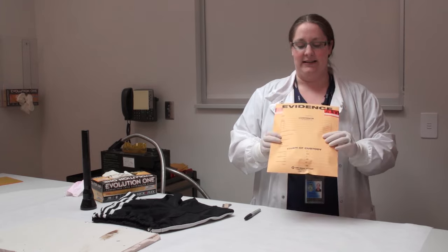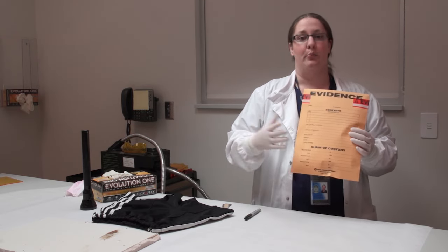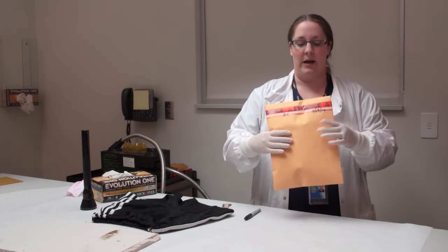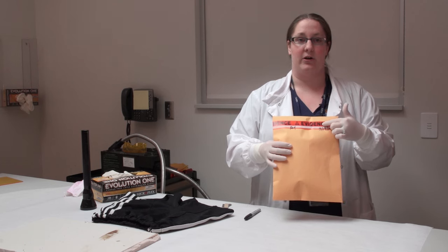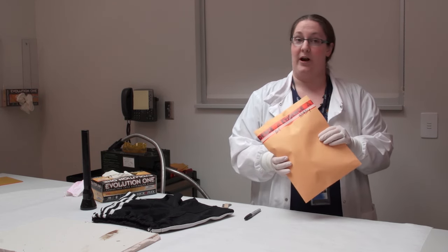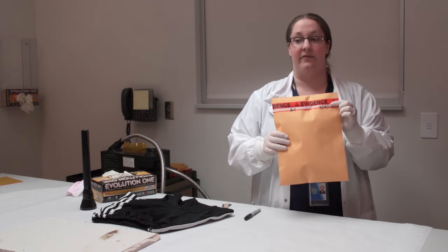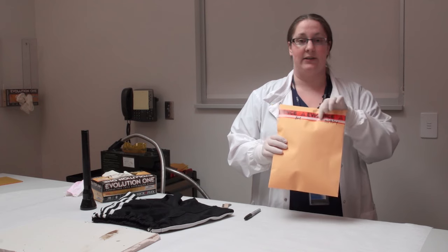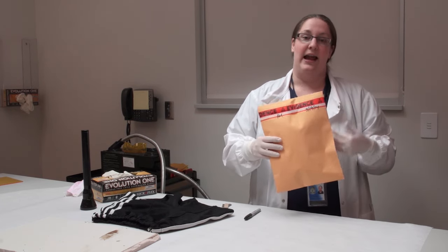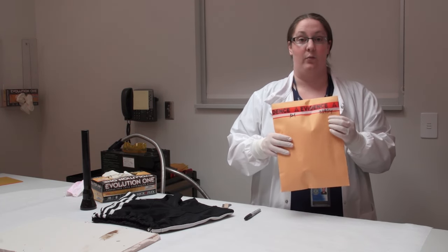When we get a piece of evidence in, it normally comes in some kind of packaging. Biological evidence needs to be in a breathable type package like paper, not plastic. When it comes in, it'll have a seal here so that we know it hasn't been tampered with. The officer or crime scene person that collects it will put the evidence in the bag, seal it with evidence tape - it's really easy to rip this tape, so I would know if someone had tampered with it.